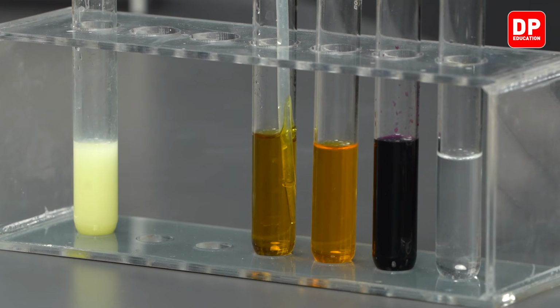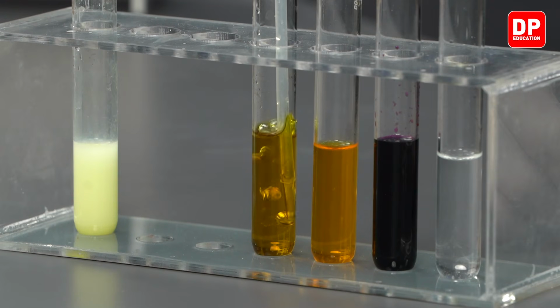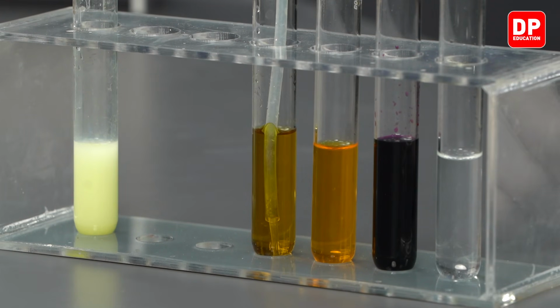You can see the color of the acidified potassium dichromate solution is gradually changing.